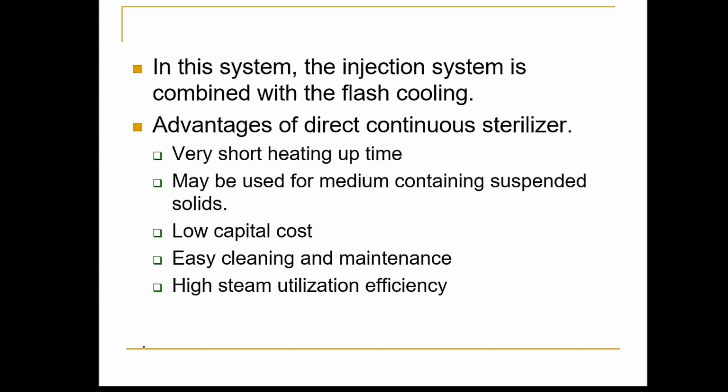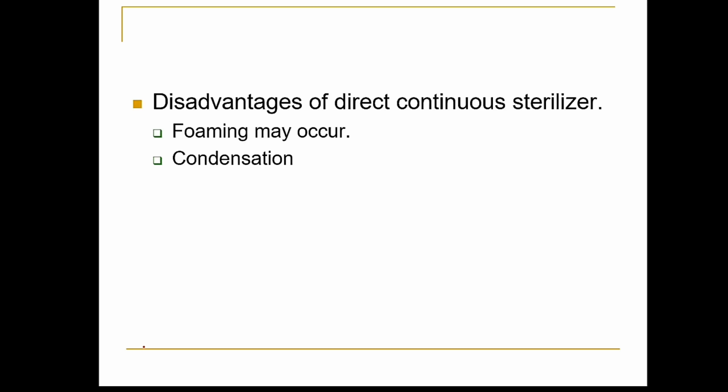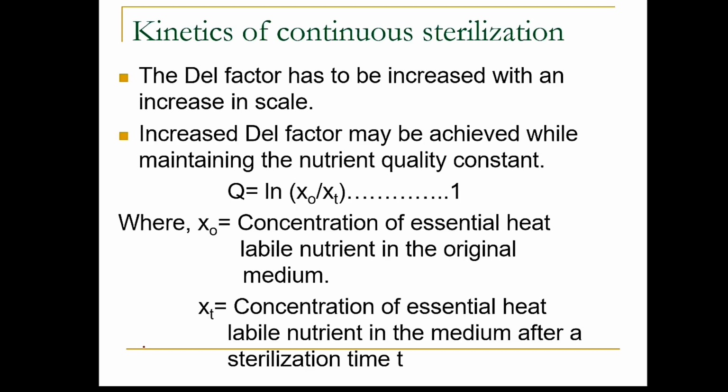Advantages of direct continuous sterilizer. Very short heating time, may be used for medium containing suspended solids, low capital cost, easy cleaning and maintenance, high steam utilization efficiency. Disadvantages of direct continuous sterilizer. Foaming may occur and condensation is also a big problem.